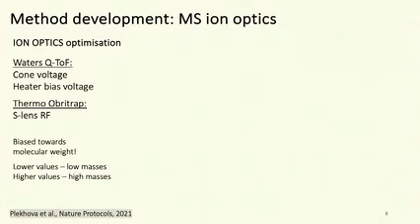The idea is the same under every circumstance. Those parameters are mainly or typically biased towards masses. So higher radio frequency will be beneficial for transporting higher masses of charged species and vice versa. You need to be aware of that, especially in the light of untargeted comprehensive applications, where our goal is to detect everything we could from our sample.